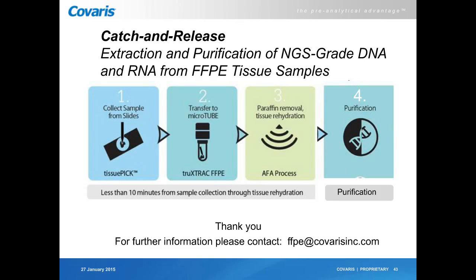Okay. Can the AFA process be applied to DNA extraction from old bones? Yes, it can be applied, but it's a different way, and I can answer that separately in an email. We have solutions based on cryopulverization to work with bones. It's not really working with this kit. It's a separate solution. But I can address that later.